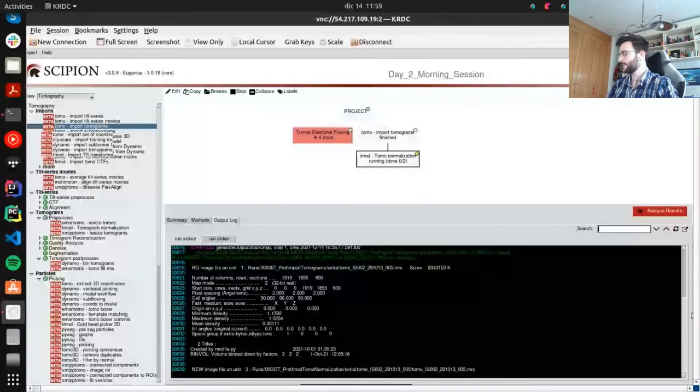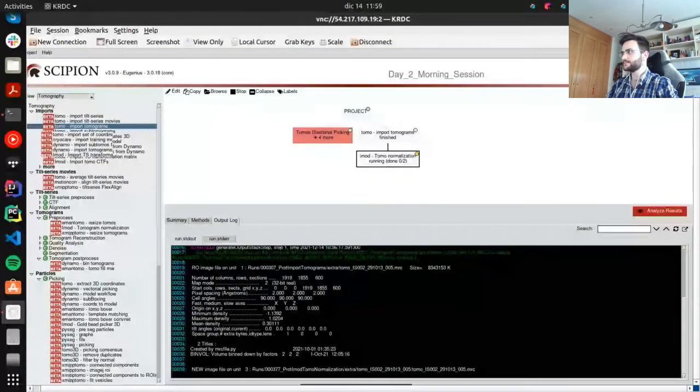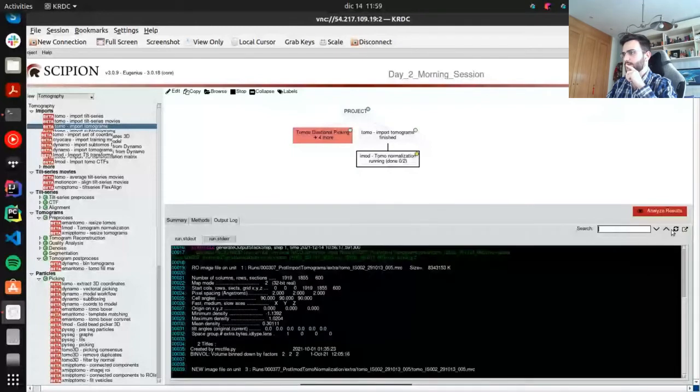And when I leave, while it's running, it doesn't create any problem? No, I don't think so. That's a remote machine working on its own. I mean, you just close the tab. Don't use the logout on the top right, because that's a Linux logout, and that will actually log you out of the account. But there's, on the left, on the panel that slides on the left, a logout option there. I'm not sure if I'm explaining it.